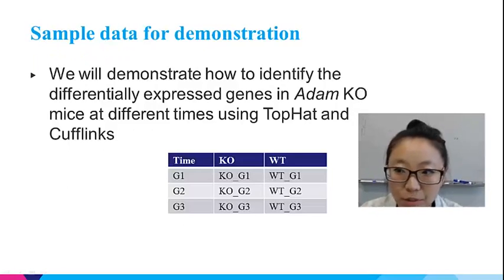So this is just a simplified introduction about RNA seq. If you'd like to know more, I'll list several reference reviews at the end of the slides. Now let's get down to data processing.